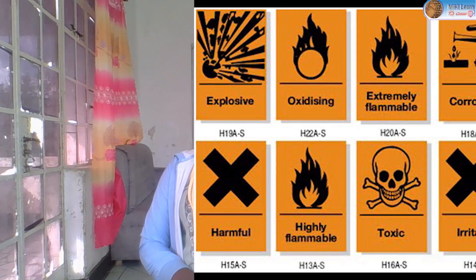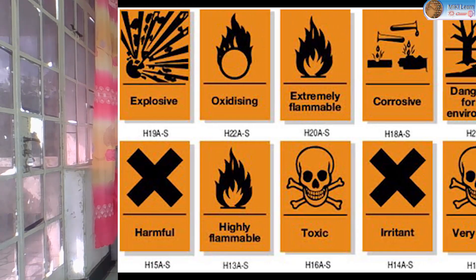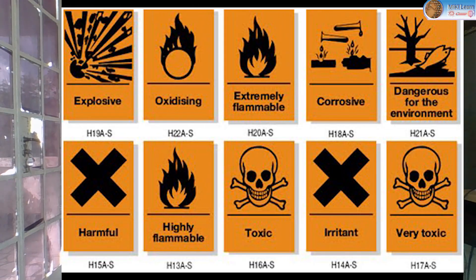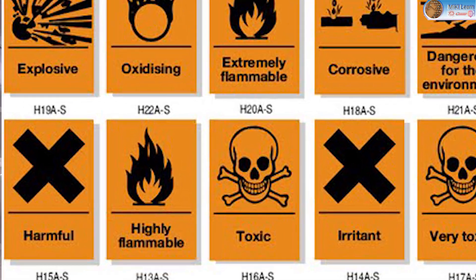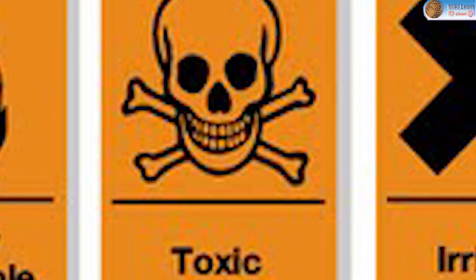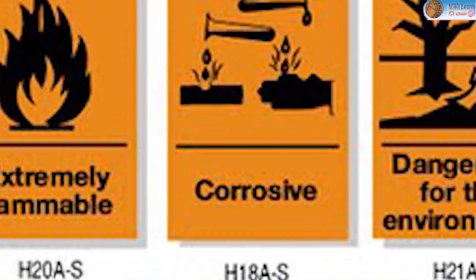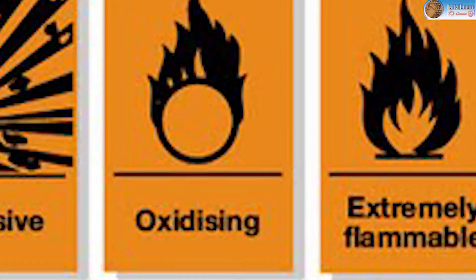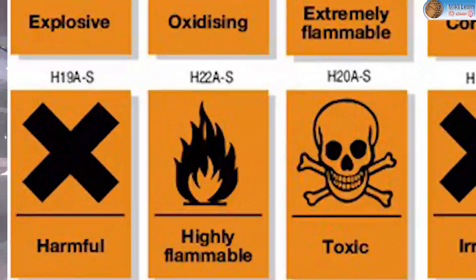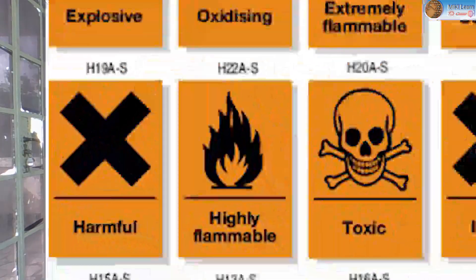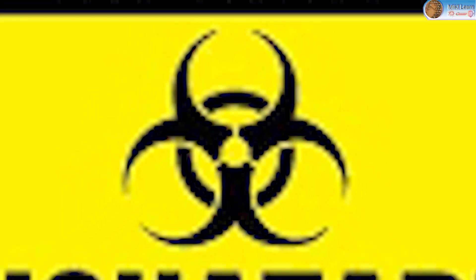A hazard symbol is a sign which indicates danger that can be caused by a particular substance or contamination. Examples include: toxic substance, flammable substance, corrosive substance, oxidative agent, harmful substance, explosive substance, radioactive substance, and biohazard.